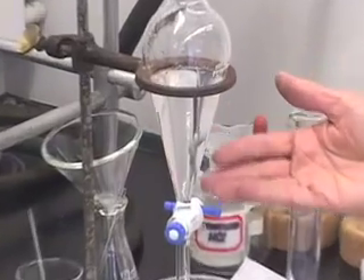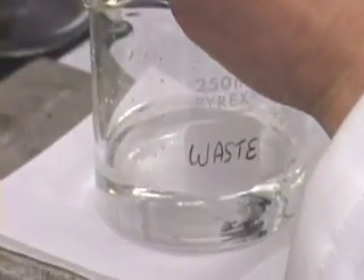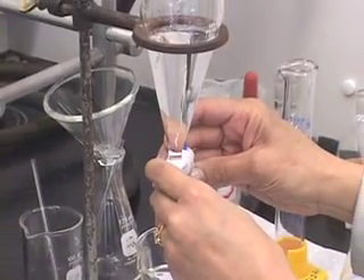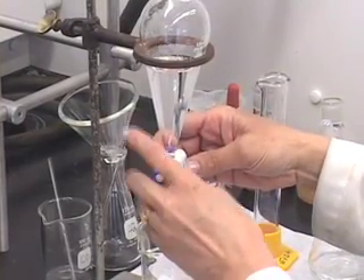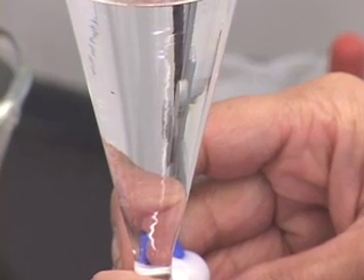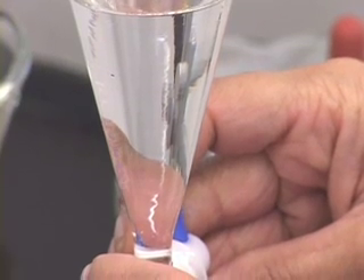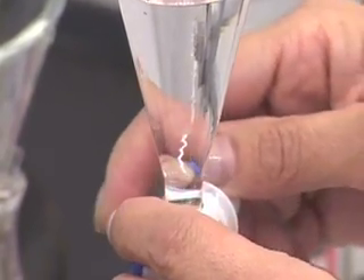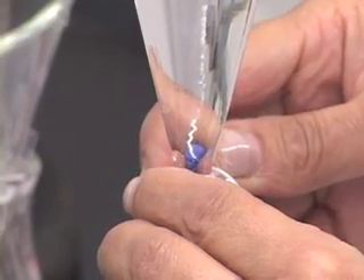Now that the layers have separated, we are going to drain the bottom aqueous layer into the waste container. It may be difficult to see the separation of the layer as it goes down, so do not panic. As it starts coming down, you can see it, and then you stop it at that point.